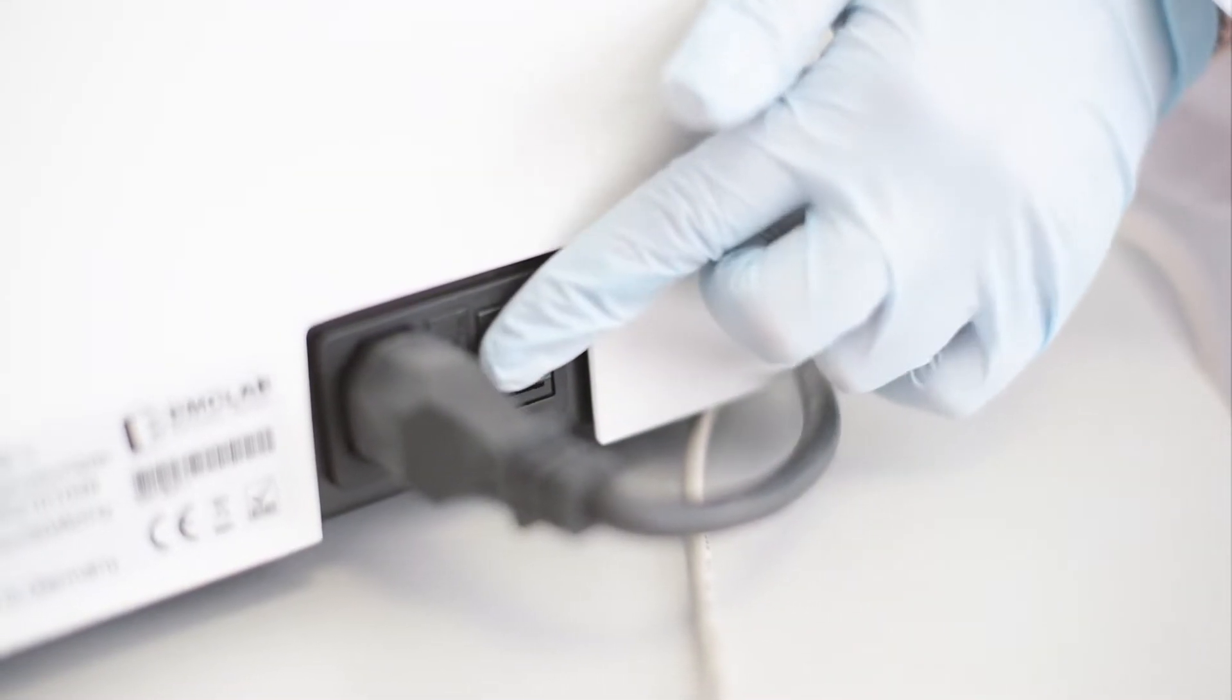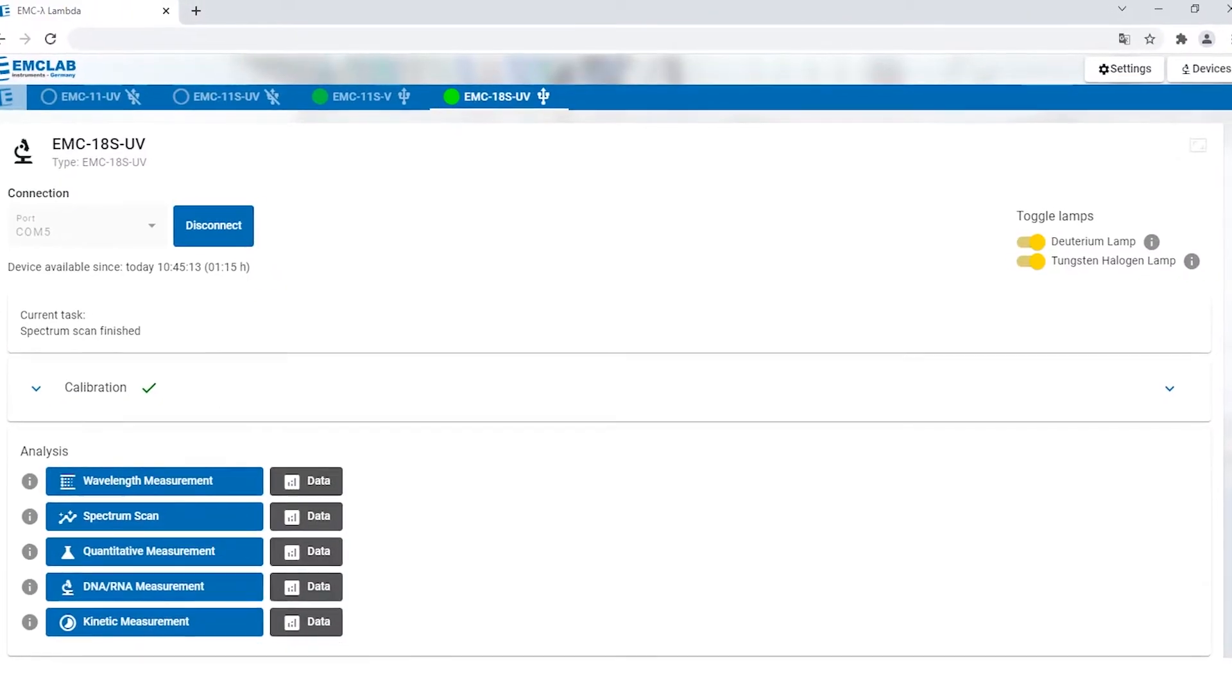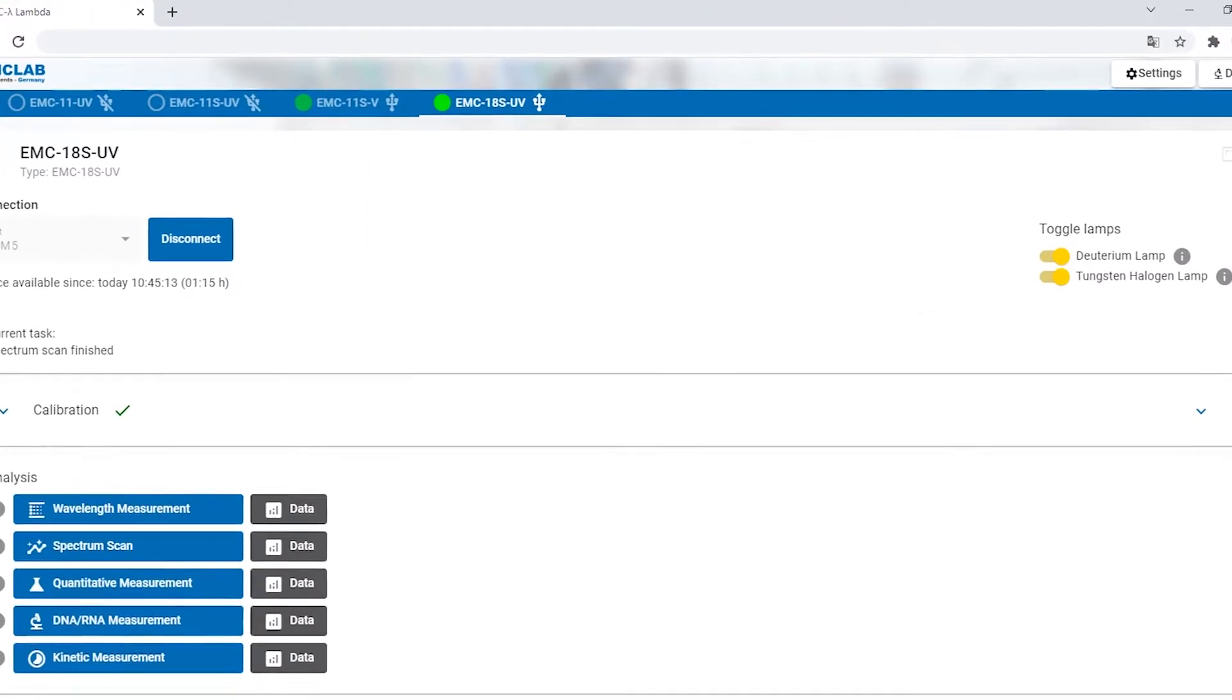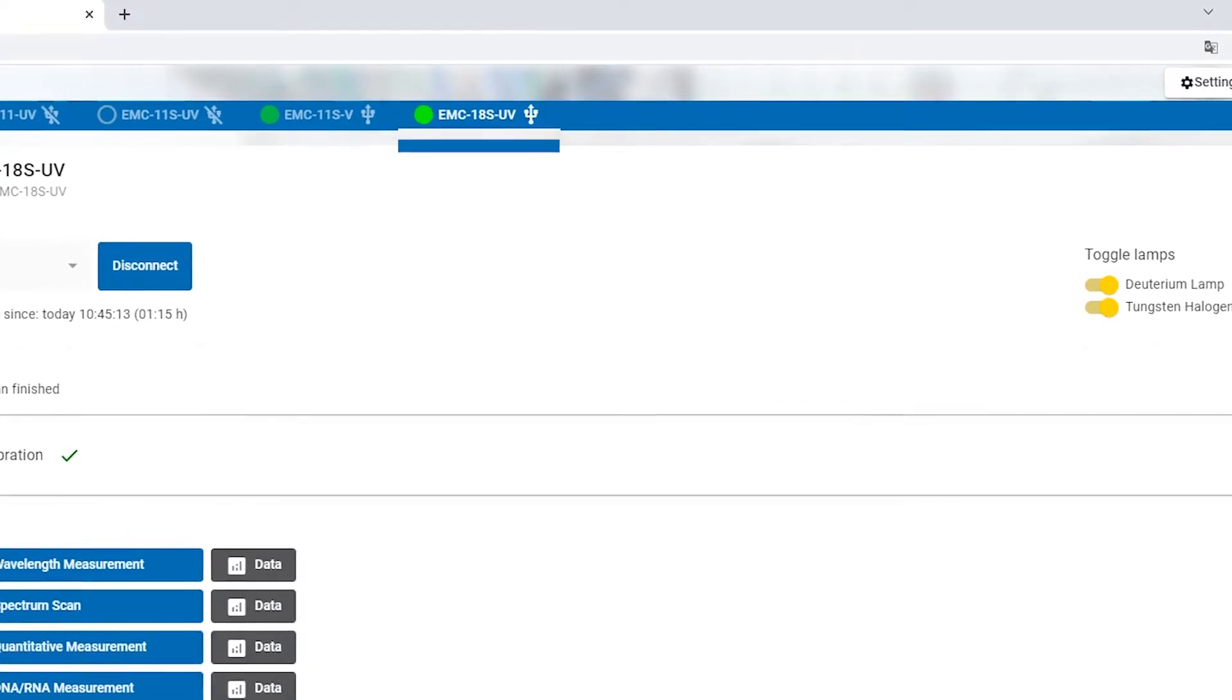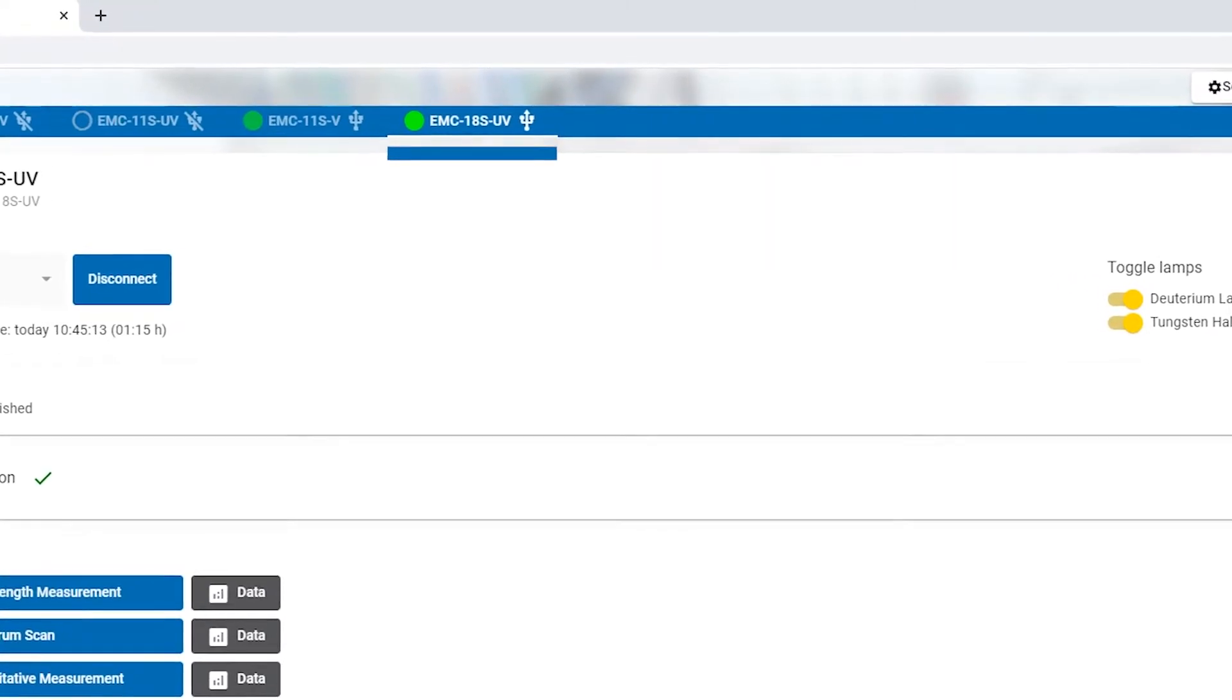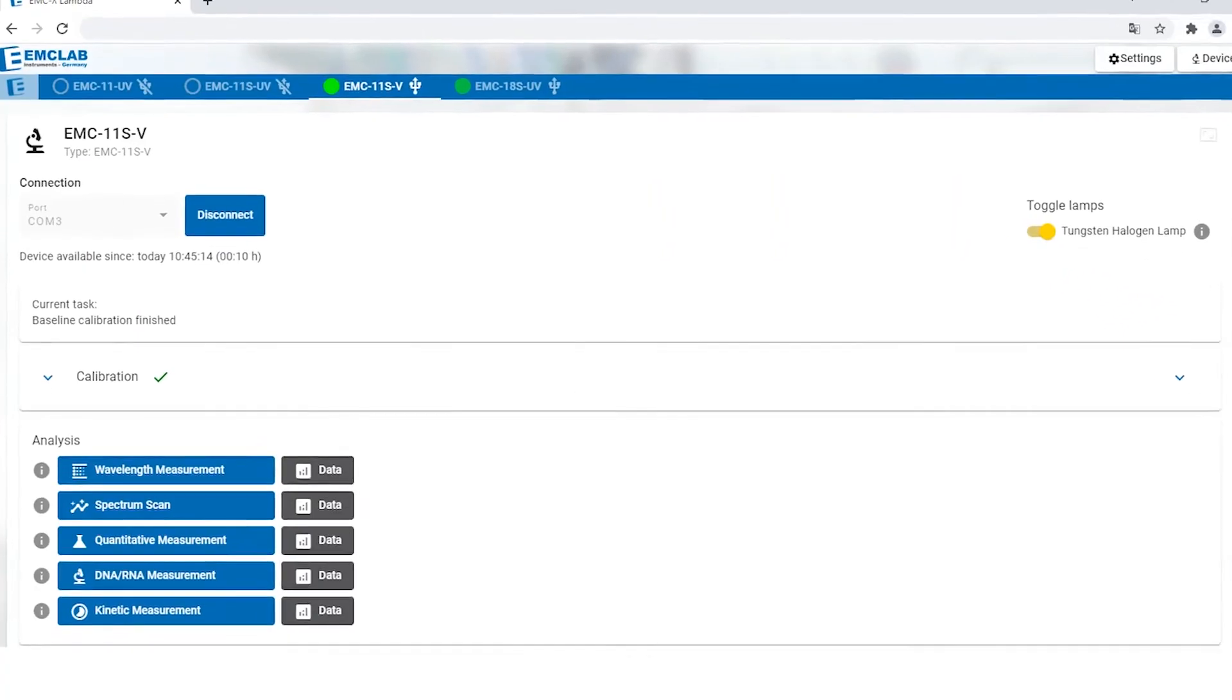After switching on the instrument, you can connect the instrument with the software and the green spot indicates with which instrument the software is connected.